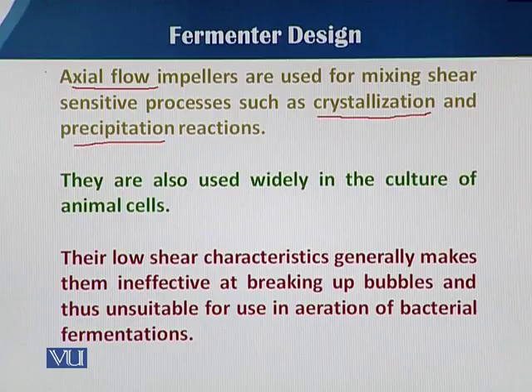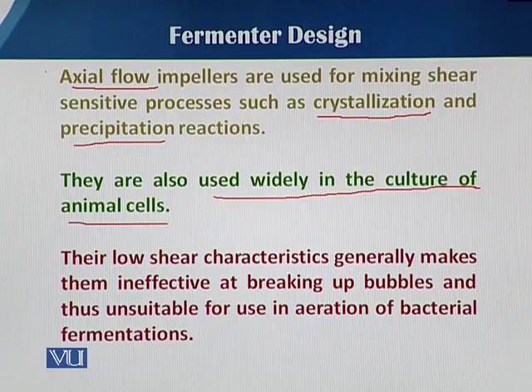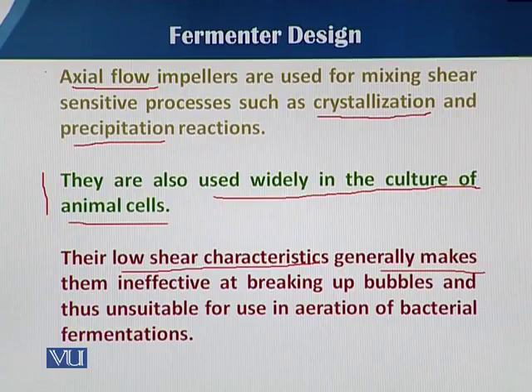They are widely used when we culture animal cells. When we use the fermentation process just to culture animal cells, there is a need to use axial flow impellers. However, the low shear characteristics generally make the axial flow impellers ineffective at breaking up the bubbles.